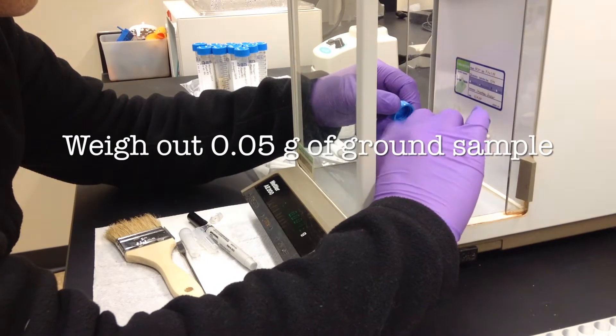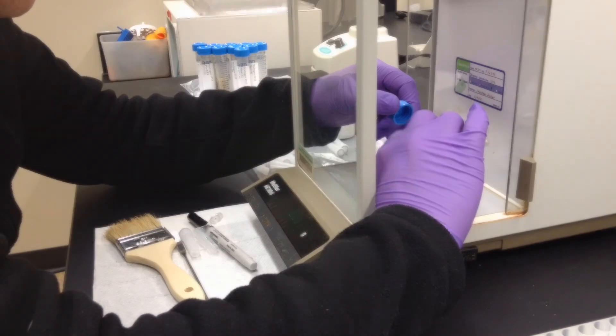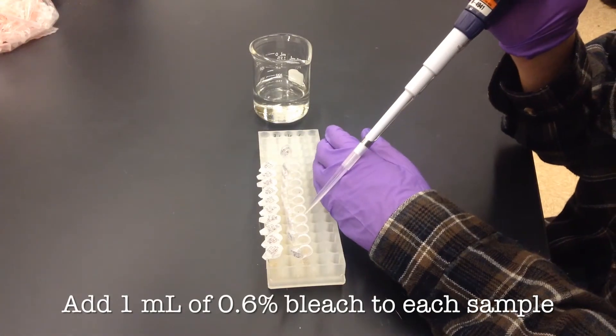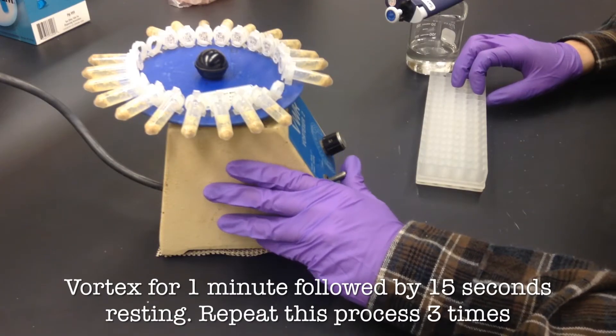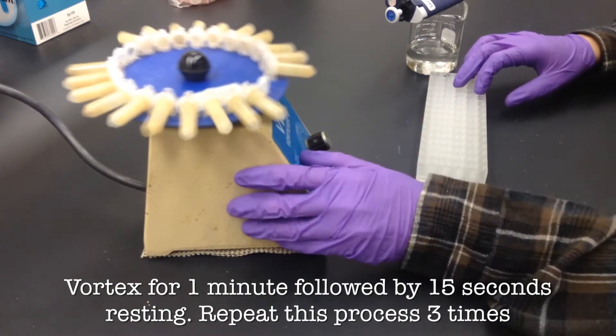We start with ground soybean tissue and weigh out 0.05 grams of each sample. We'll add a mil of a bleach solution to each sample for sterilization and then vortex those samples three times for one minute followed by 15 seconds of resting.